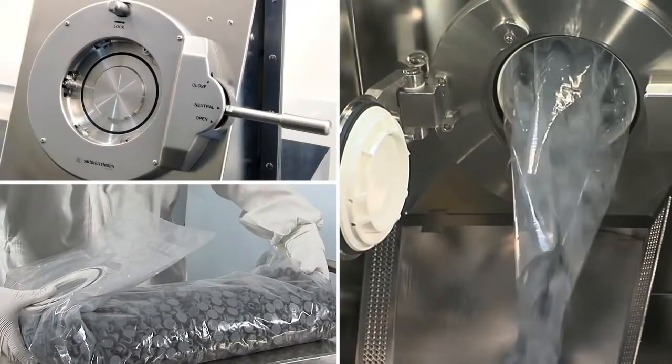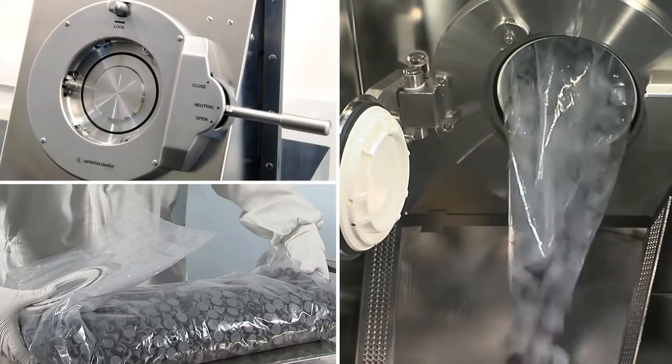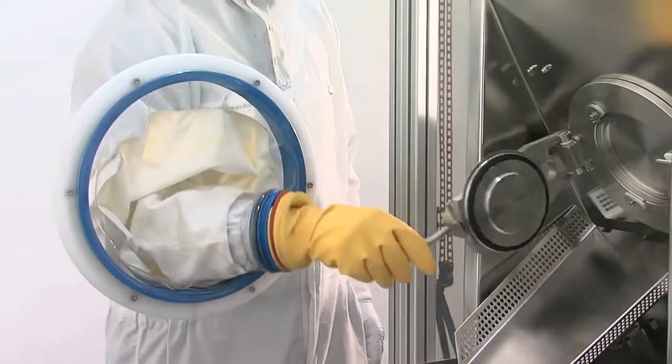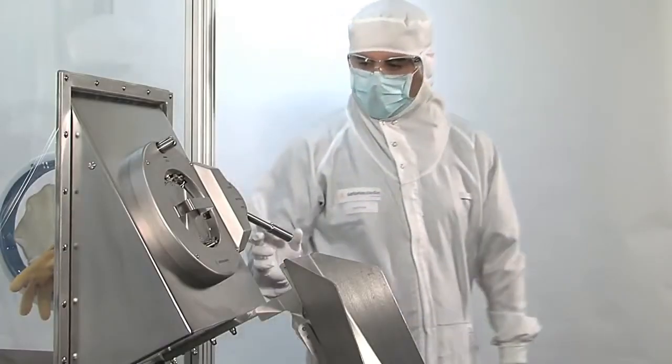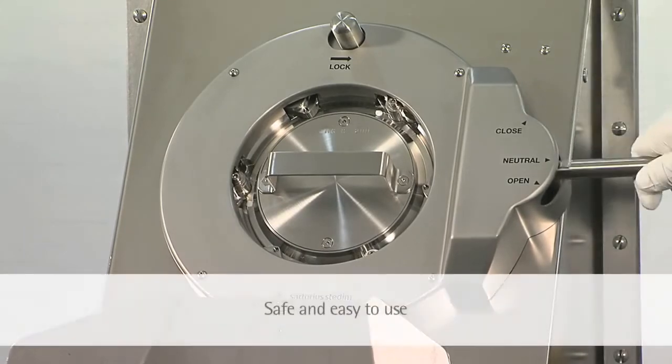The BioSafe technology is a safe and robust solution for the aseptic transfer of sterile components. The dummy service connector allows for the decontamination of critical areas during the isolator VHP cycle.